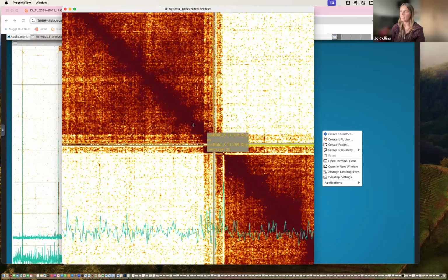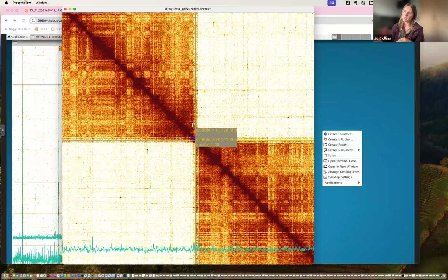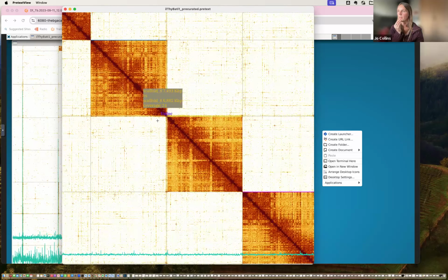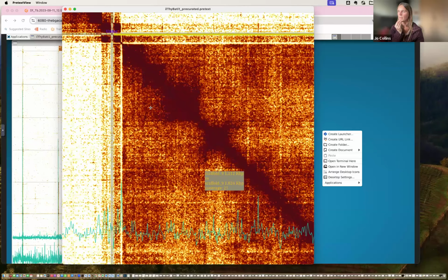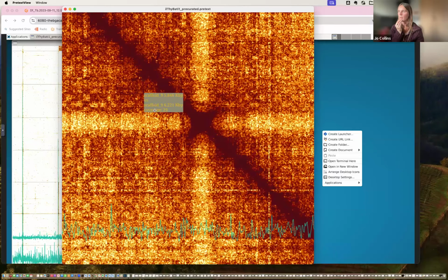So it's a way of saying that this data, we know it belongs here, but we can't place it, but it still might be useful information for you to know that it's part of this scaffold, that part of this chromosome. Right, sorry, I'm trying to do this quite quickly. So we'll go on to the next one, going through.